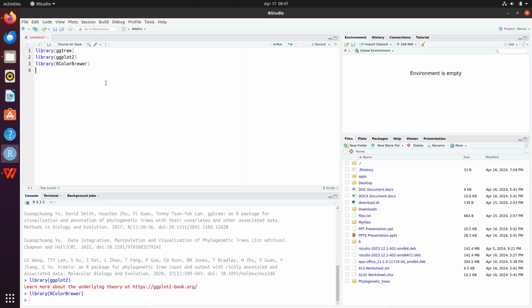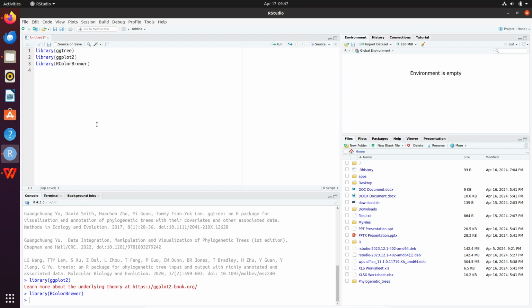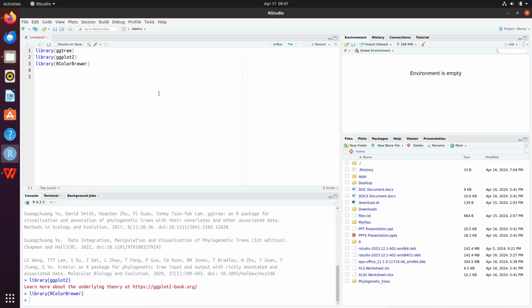Okay, so I'm here. I've loaded all my packages. After loading the packages, we also need to set a path to where our data can be found. I'm using a Linux system, and I know my path is going to be /home/. I know the path, so I'm going to set that in R first. So I will say setwd and I'll give the path. So it's /home.